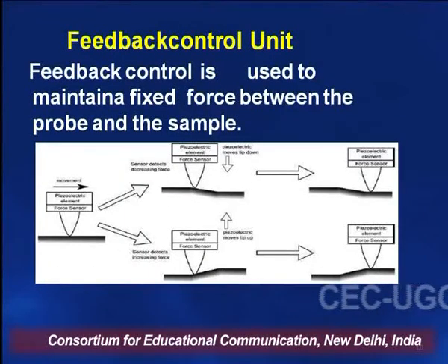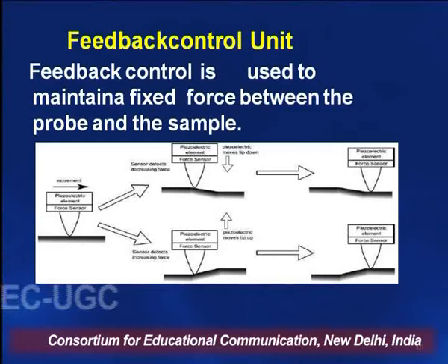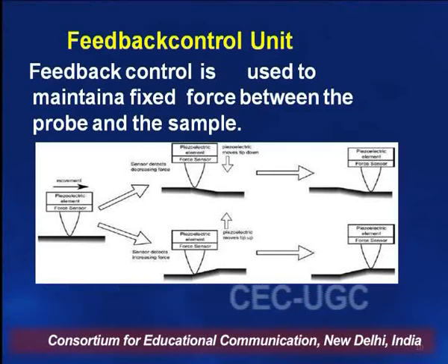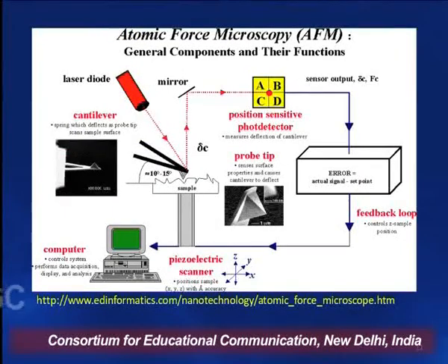And feedback control is used to maintain a fixed force between the probe and the sample. This will move the probe on the surface, and this is the combination of all the instruments, all the parts which are used in atomic force microscopy.